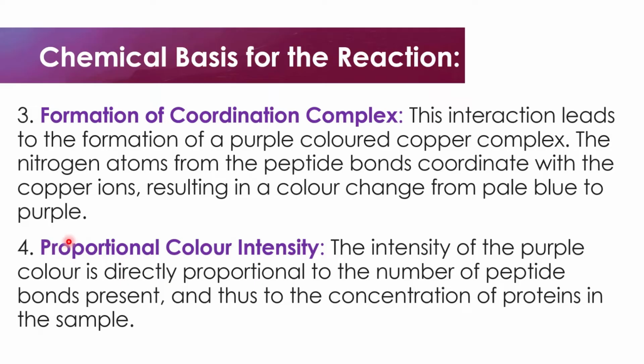And the last is the proportional color intensity. Over here, the intensity of the purple color is directly proportional to the number of peptide bonds present and thus to the concentration of proteins in the sample. So what it means is that the more peptide bonds present, the higher the intensity of the color.